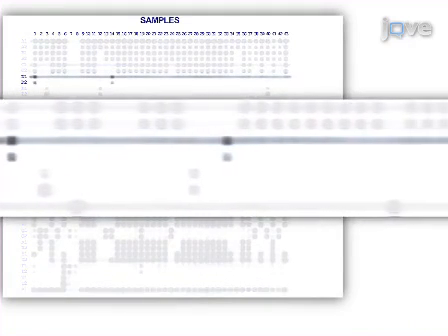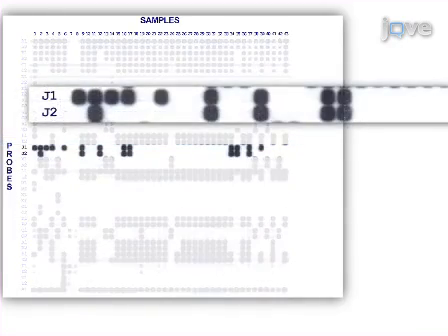Probes D1 and D2 have relatively weak signals compared to the other probes. This may be due to larger amplicons leading to less efficient amplification. Finally, probe J2 is negative in several samples where probe J1 is positive. This most likely represents a mutation in the J2 binding site for these samples.